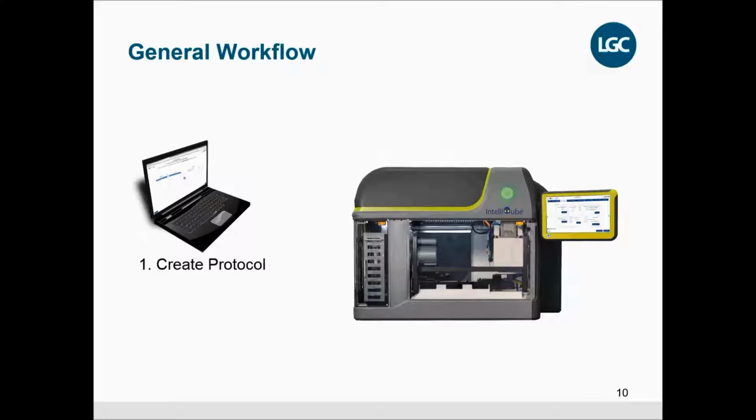The IntelliQube can be hooked up to your laboratory's network and can therefore be accessed by a PC in order to generate your protocols.